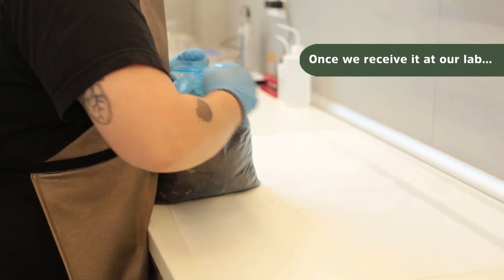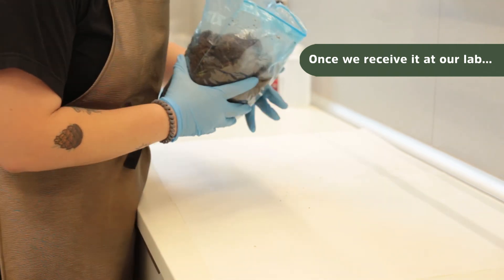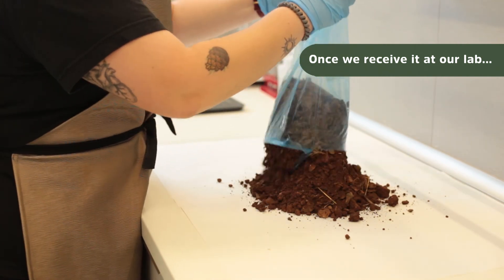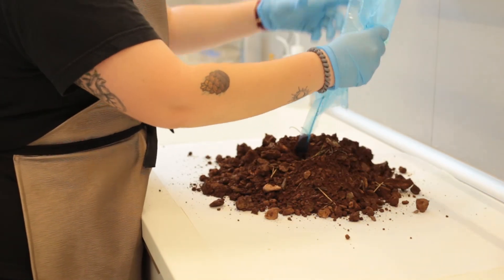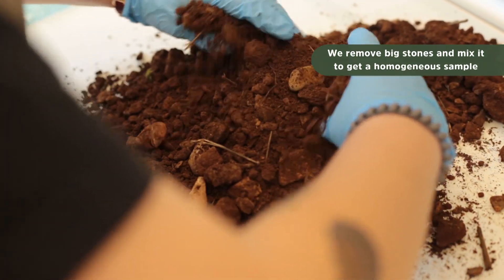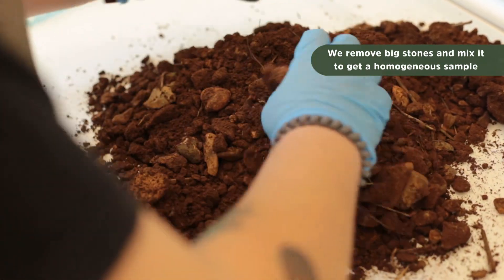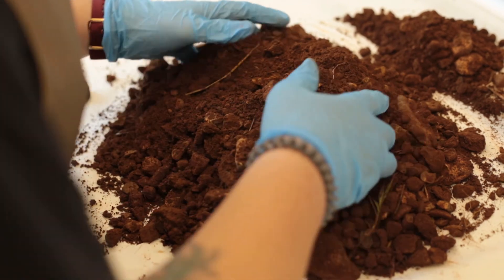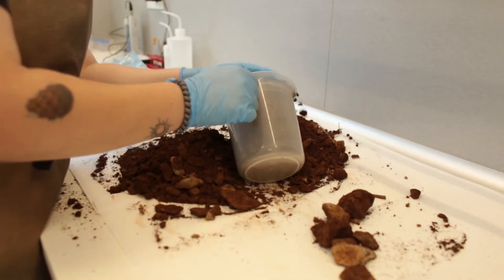Once the sample arrives at the lab, we will homogenize it. If you have taken off the bigger stones and little pieces of grass, that's better. If not, don't worry, because when we homogenize it and sieve it for the chemical analysis, they come off. So don't be too fussy about that.